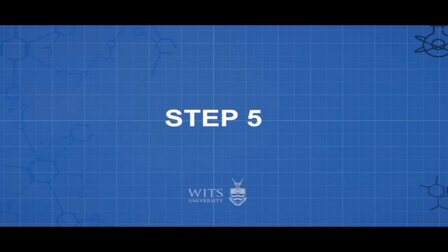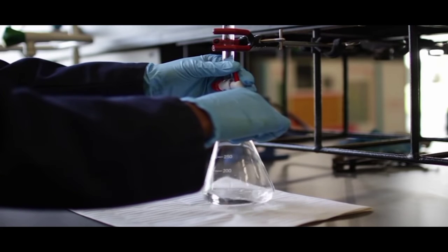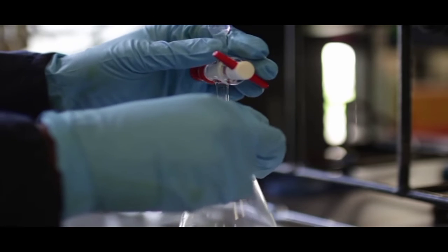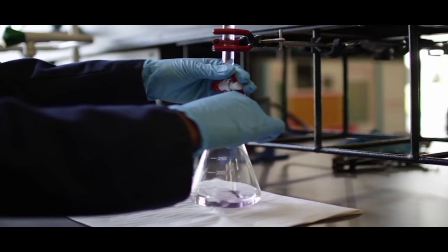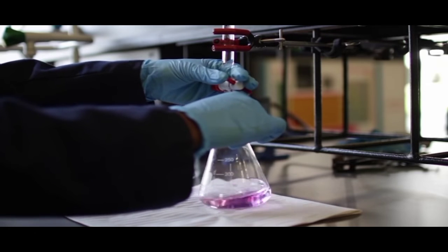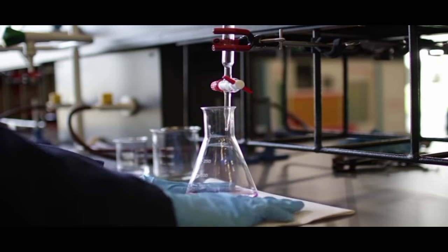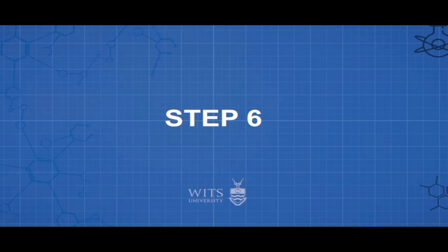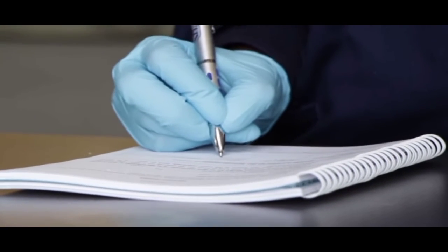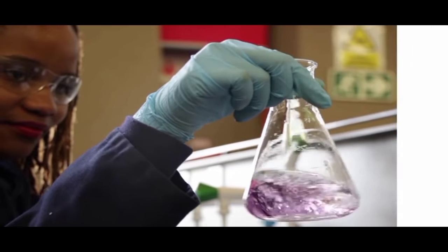This solution contains a chemical that will react with the analyte's chemical sample in the conical flask. Step 5. The solution from the burette is run into the conical flask. The solution is added one drop at a time and swirled to mix the solutions as the endpoint is approached. Eventually, a color change shows the correct amount that has been added to react completely with the analyte's chemical in the sample. Step 6. The volume of solution added from the burette is noted. The titration result can then be used to calculate concentration.